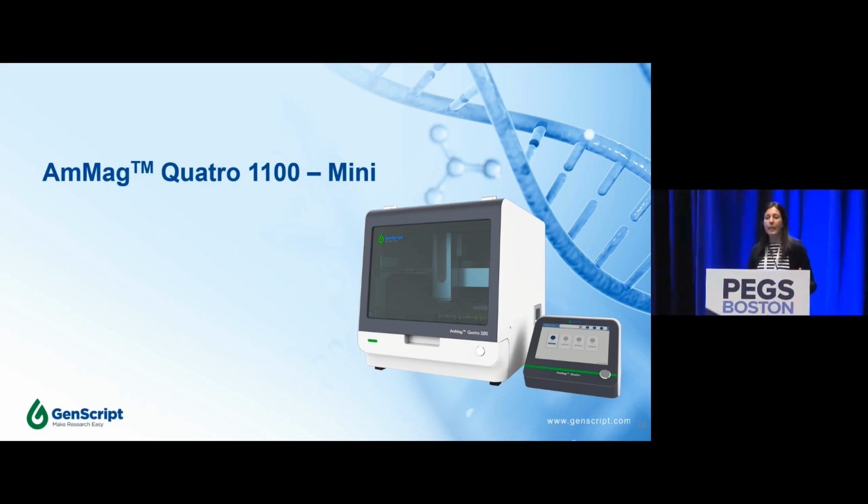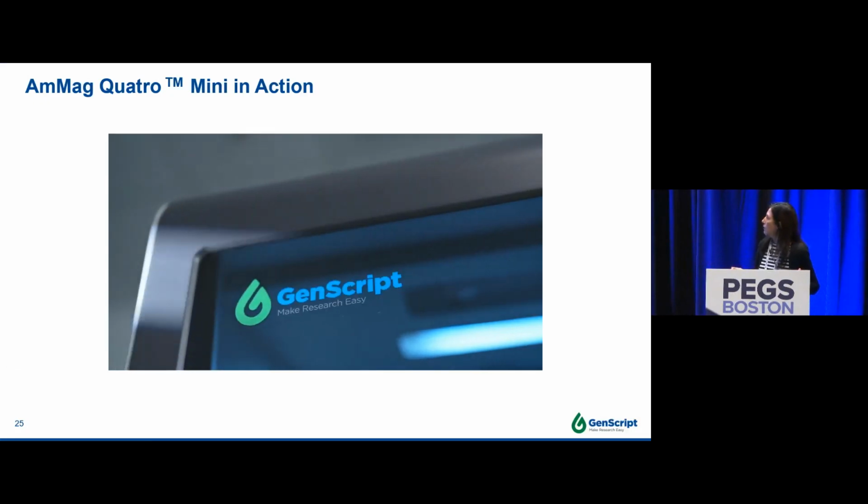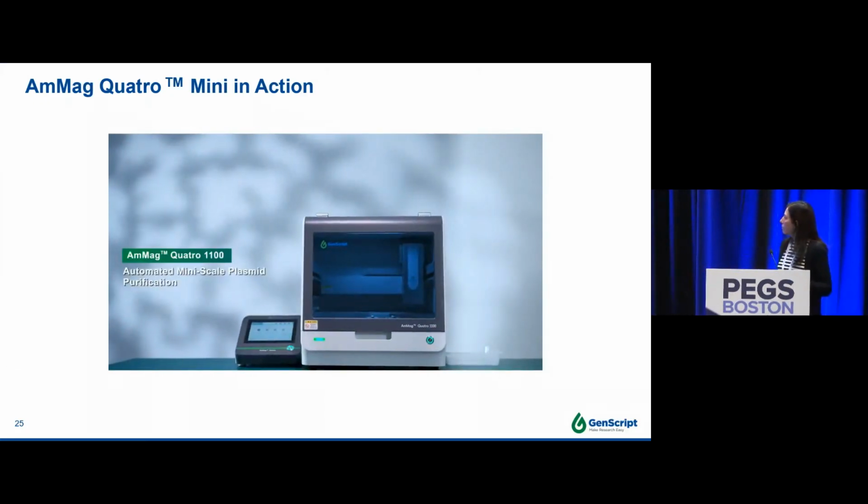instrument. The technology is exactly the same. The steps are exactly the same. What changed is the layout of the instrument. Now, actually I can quickly show you the video for the mini prep instrument.